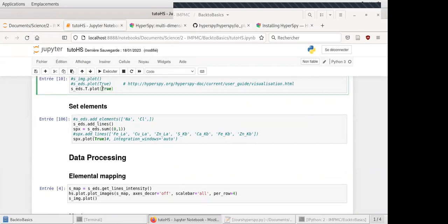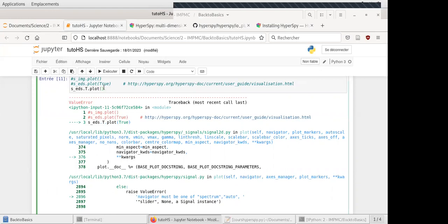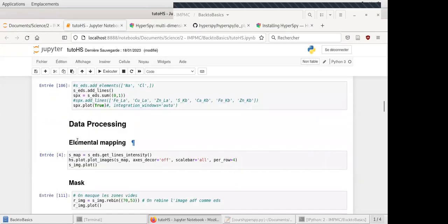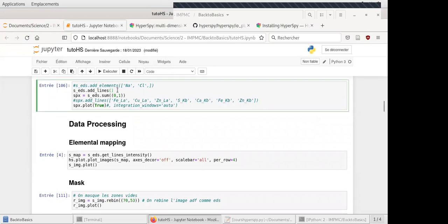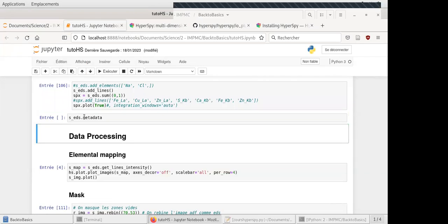If you set the 'plot_labels' option to True, the labeled elements will be plotted on the spectrum. You can also access the metadata of your file — it's a selection of the interesting metadata like the elements selected in Bruker, the energy scales you are using.